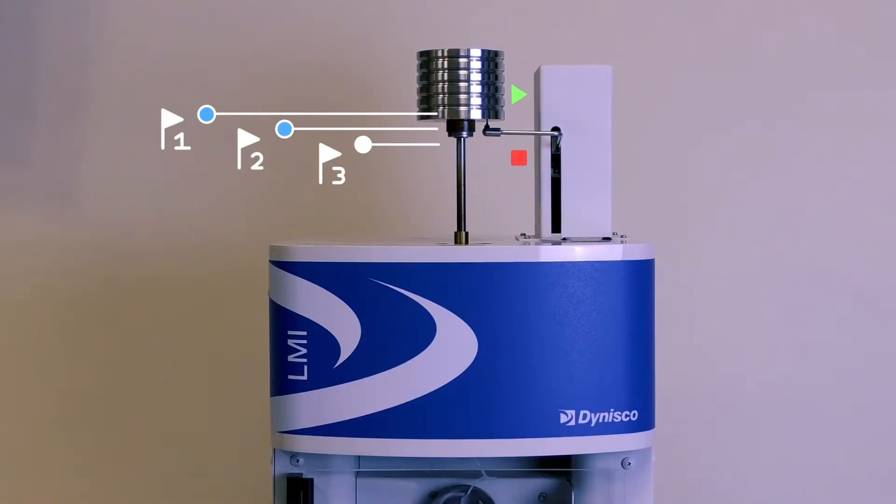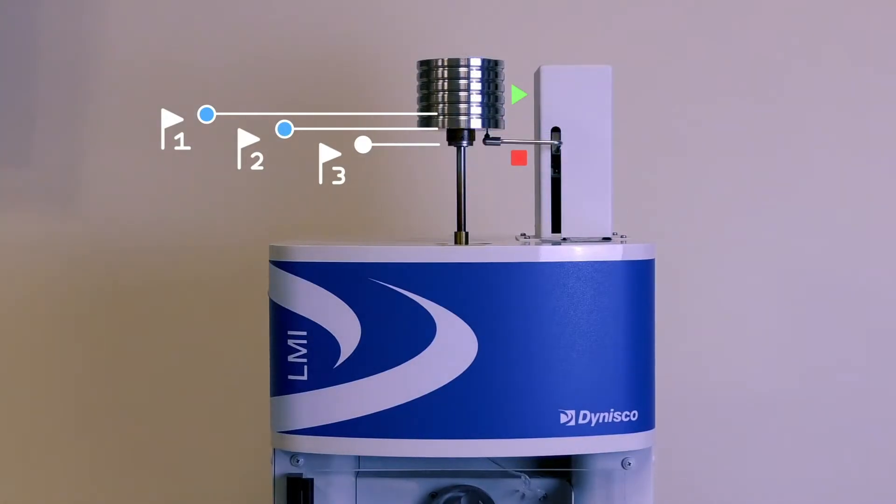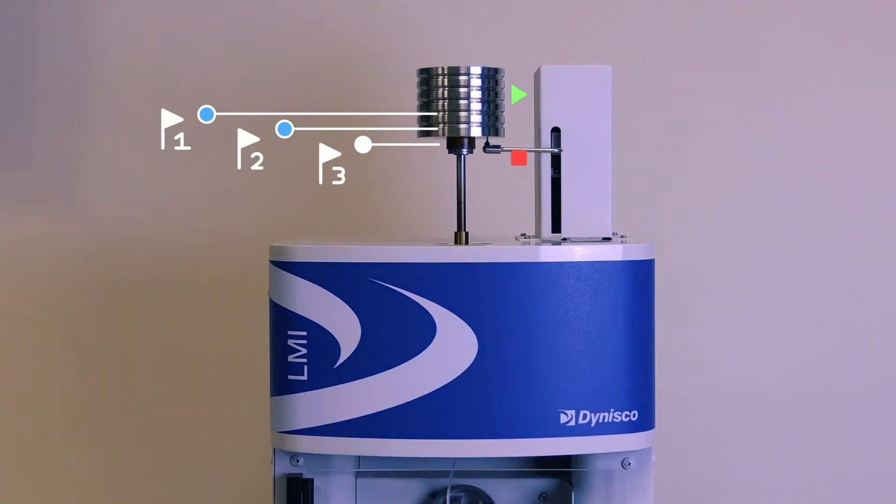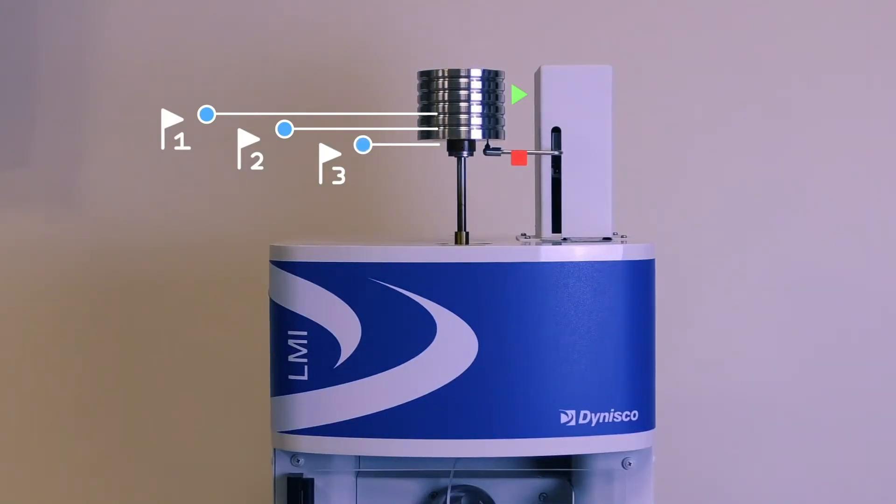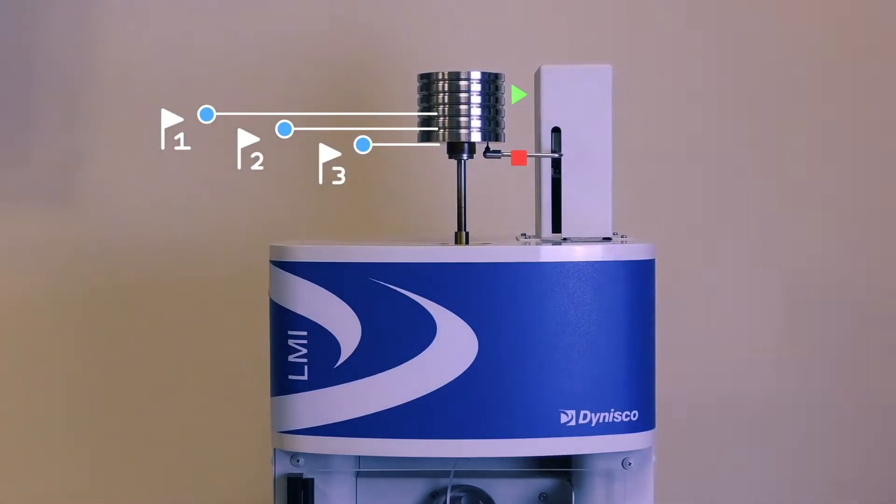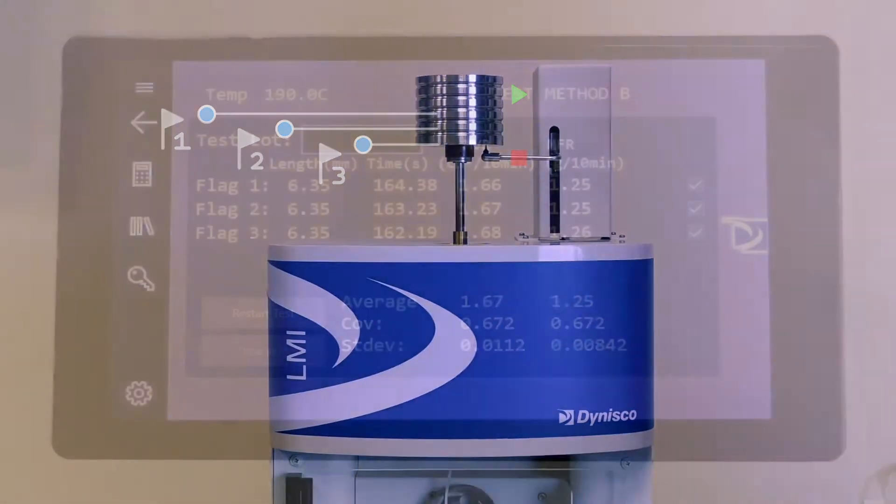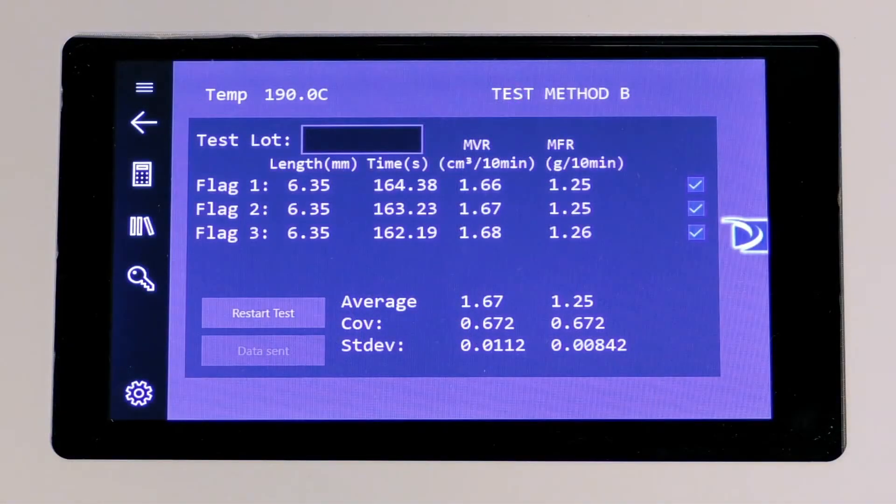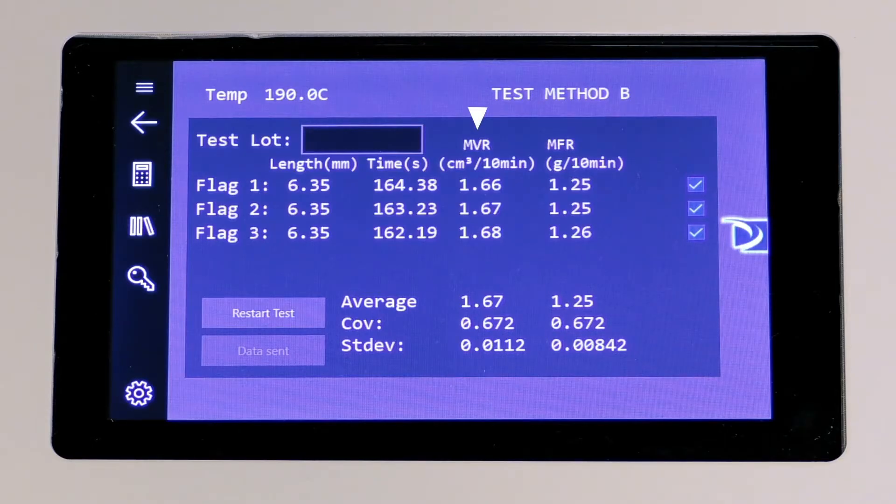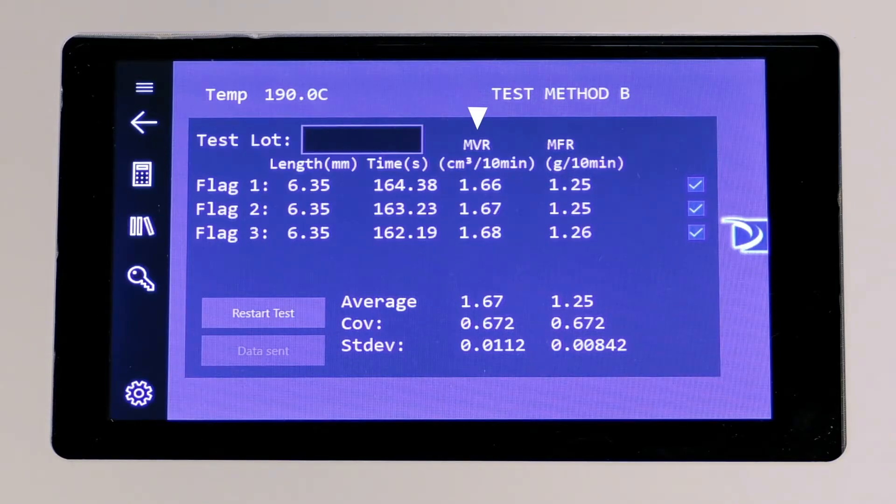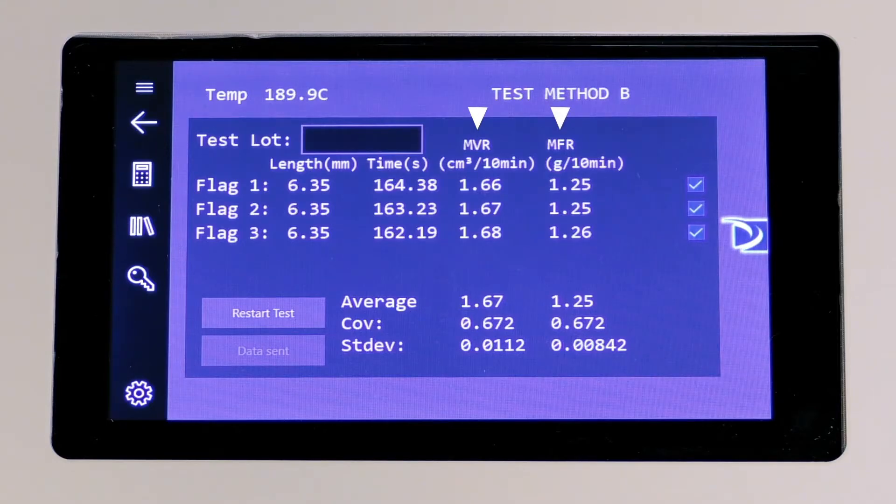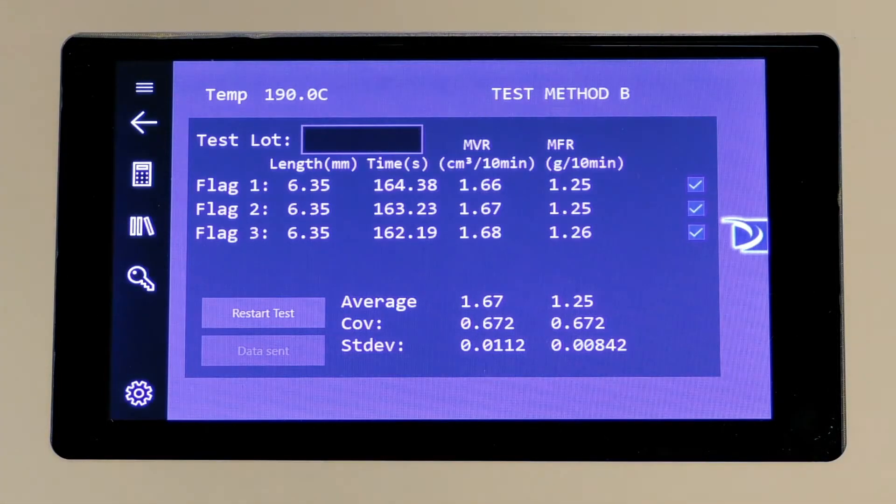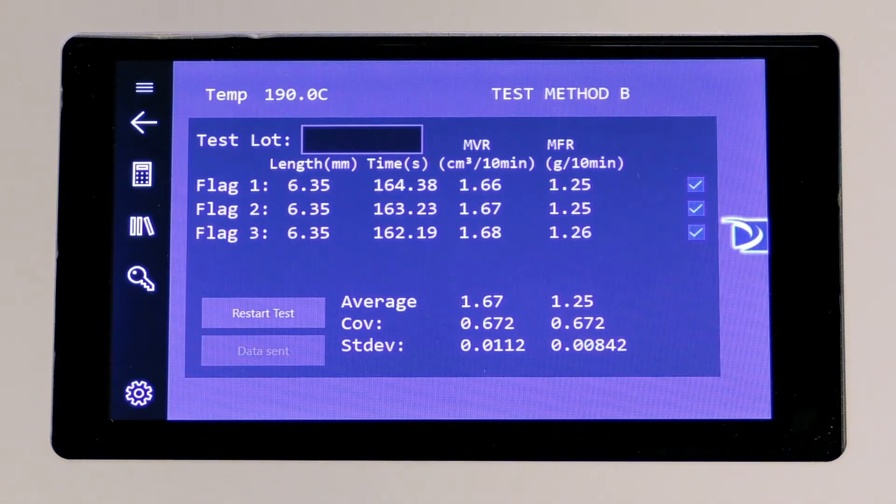Once the scribe line is reached, the encoder begins the distance measurement known as flag length, while capturing the time it takes for the piston to descend. Once the encoder arm has traveled the distance of the flag selection, the LMI will render the melt volume rate in cubic centimeters per 10 minutes, along with the melt flow rate in grams per 10 minutes. This concludes the Method B test.